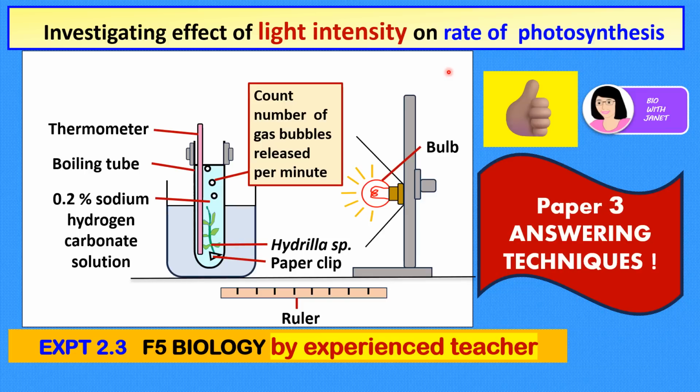I'm teacher Janet. In this video, we're going to discuss the effect of light intensity on the rate of photosynthesis. So we'll be discussing this experiment in detail, and we must know how to set it up and then know what the MVs and RVs are and so forth.